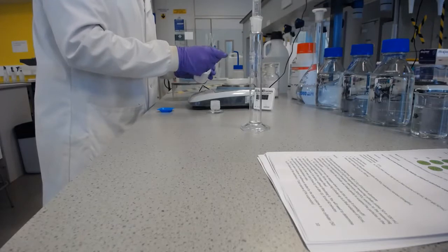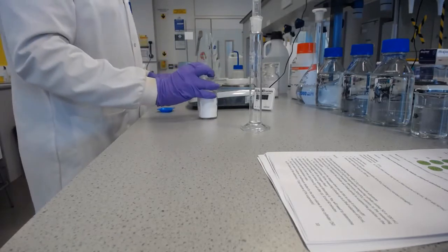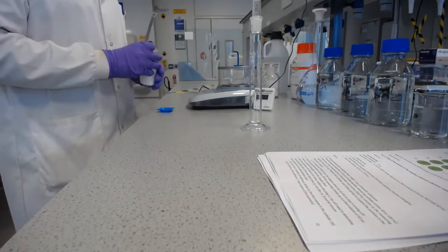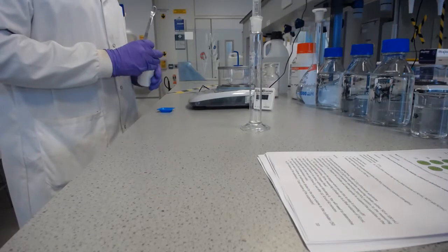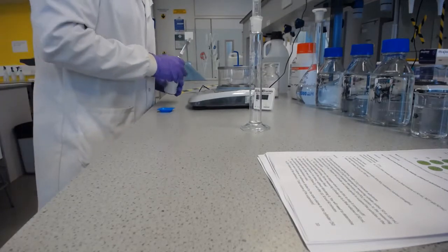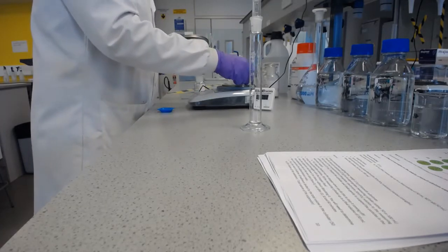And once I think it's on the money, I'll just put the cover on, just to be sure that I've got an accurate amount. 2.51 grams, good enough, I think. So we can take that off.